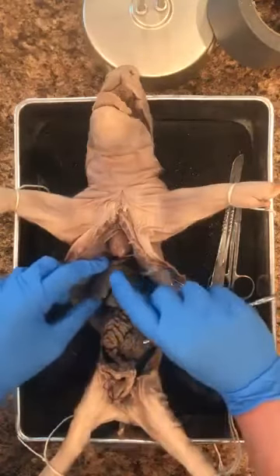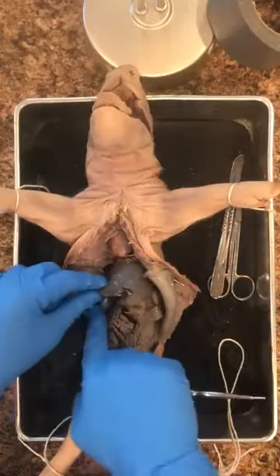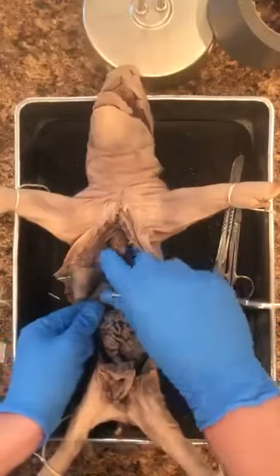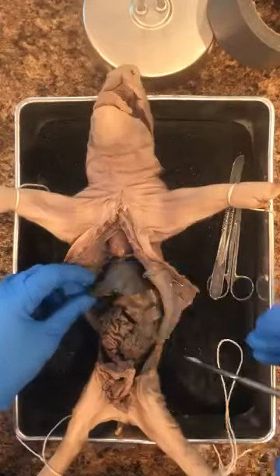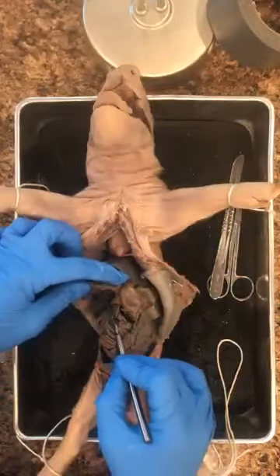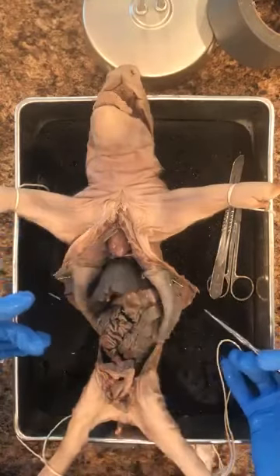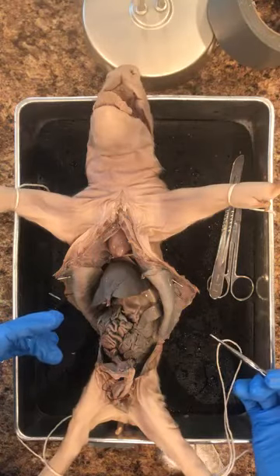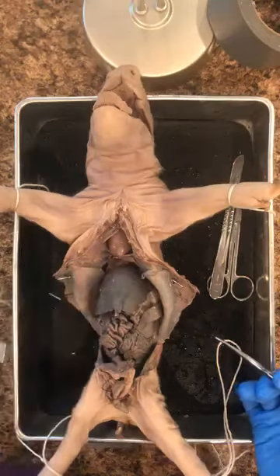I'm going to be removing this momentarily. 1, 2, 3, 4, 5. Okay, 5 lobes. Underneath of it is going to be the gallbladder. The gallbladder is not so green in this case, probably because of the preservatives, but here's the gallbladder. It is still that sac-like thing. Okay, as a reminder, the function of the liver is going to be to detoxify the blood. It also secretes bile and other chemicals for the digestive system. So that's the liver.